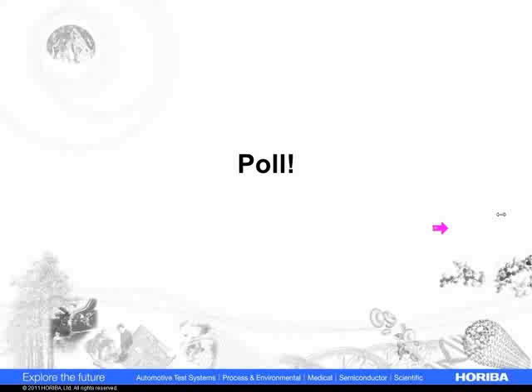So William is saying yes, he monitors D10, D50, D90 plus the mean. That's good. We always recommend whenever you send samples into our lab, either for method development or to evaluate an analyzer, we almost always send out the reports with D10, D50, and D90 as a minimum. And we like that because it gives you an idea of where the central part of your distribution is. It gives you an idea of the fine particles and an idea of the coarse particles.